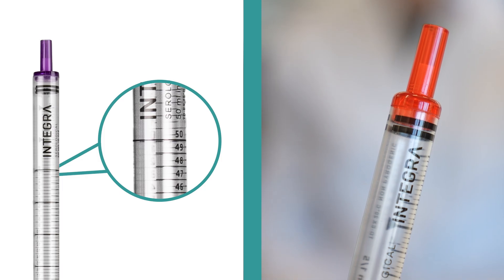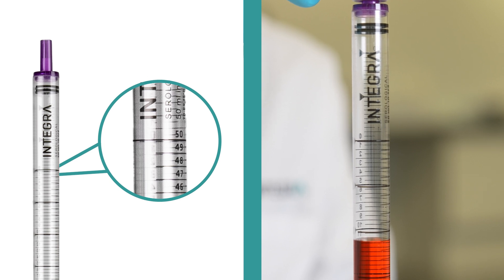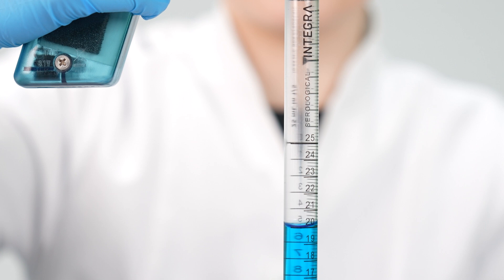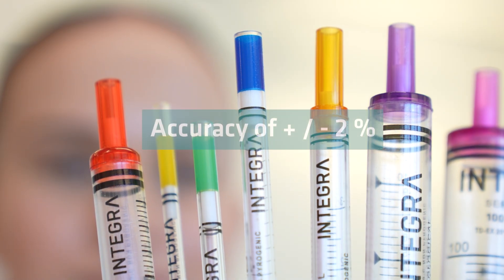The pipets have a sharp, easy-to-read printed graduation on a clear background, which means the liquid level is easily seen. The graduation is bi-directional, so the scale can be read in ascending or descending order. The pipets have an accuracy of plus-minus two percent.